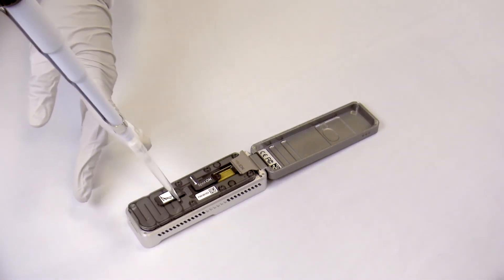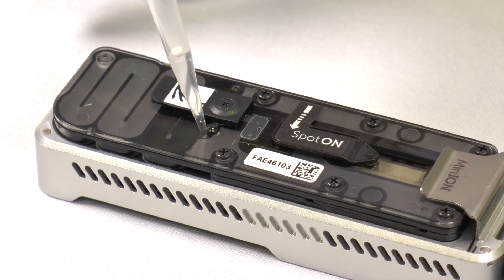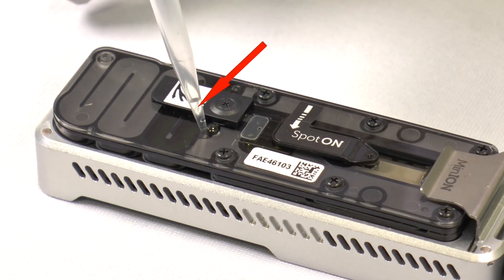Once we've removed the air pocket, we load 800 microlitres of priming mix through the priming port using a P1000 pipette. Another tip to avoid introducing air bubbles into the system is to not expel all of the liquid into the port, leaving some behind in the tip.